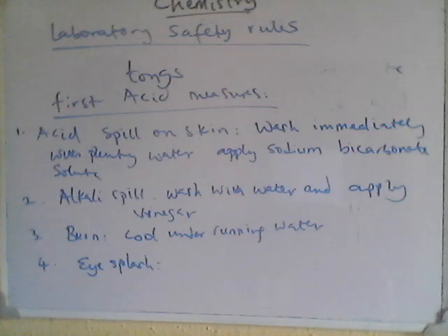When you have cleaned your equipment and they are dry, you store them in proper places. Handle delicate instruments like burettes and thermometers with care. Finally, you can calibrate measuring equipment regularly if needed. These are ways that you can maintain and handle the apparatus.